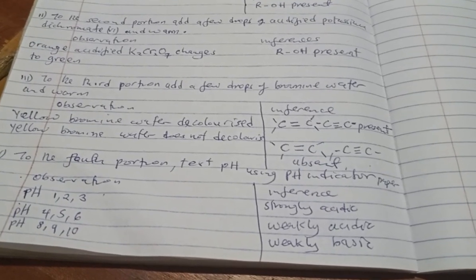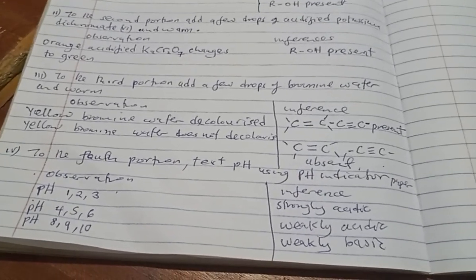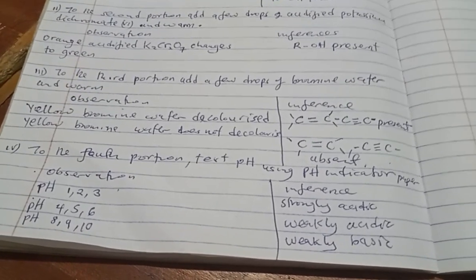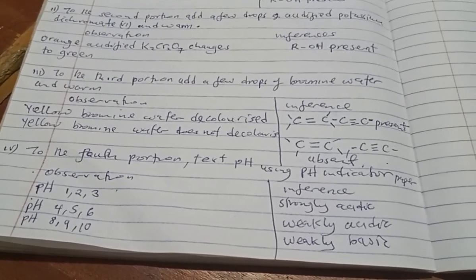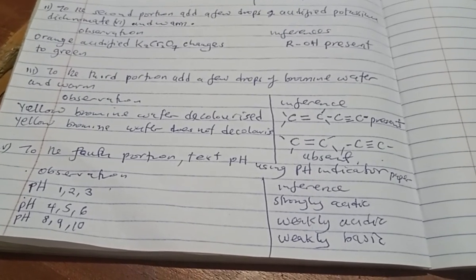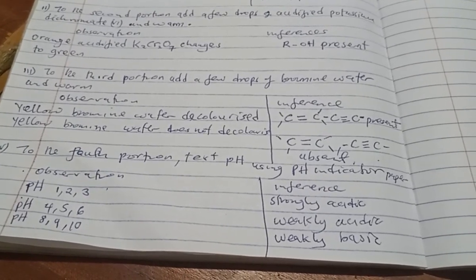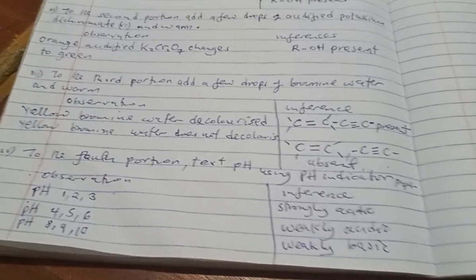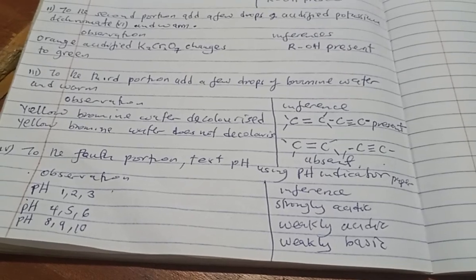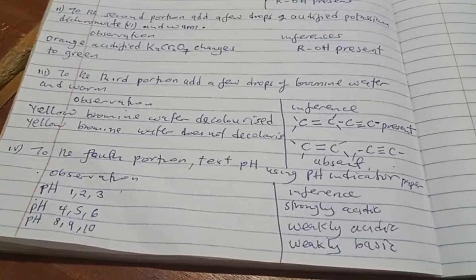If you have seen 4, then you say pH 4. If you have seen 5, you say 5. If you have seen 6, you say 6. Then that is weakly acidic. If you have seen 7 corresponding to color 7, then you say pH 7, and that one is neutral. Sorry, I have not included it here. If you see 8, 9, or 10, then that is weakly basic. If you see 11, 12, 13, and 14, then that one is strong base.